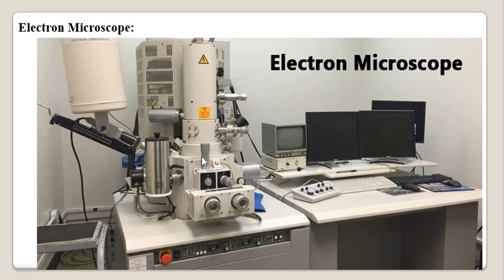So the illumination system: in the compound microscope, what was the source of illumination? Light, or a tungsten bulb, was the source of illumination. In the electron microscope, short wavelength electrons are the source of illumination, right? Okay, after that, let's move ahead and see the composition, or construction, of this electron microscope. But before that, let's see some comparison between the electron and compound microscope.